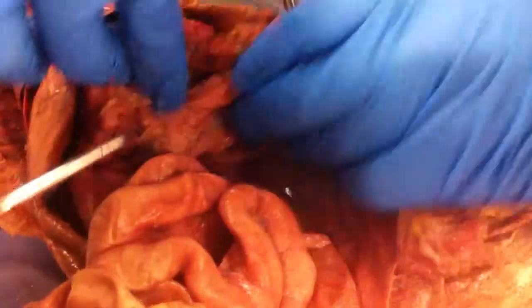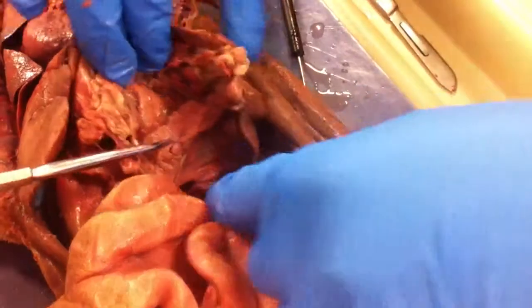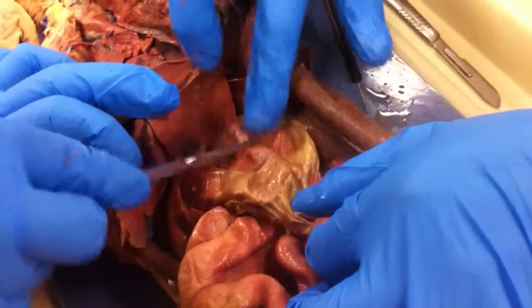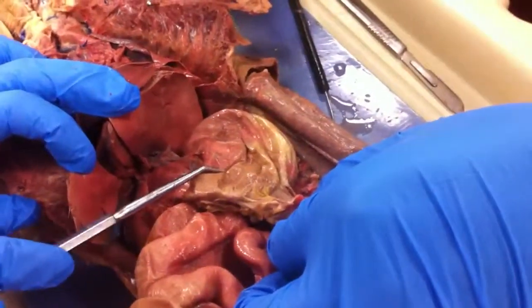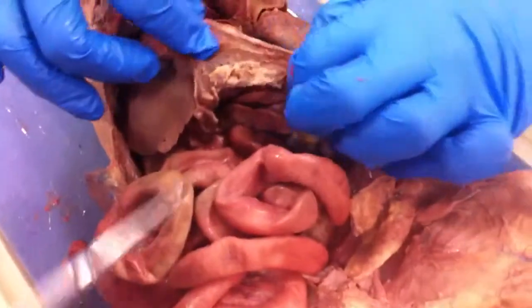And then if you move under the stomach, you have the pancreas right here. Then on the side of the pancreas, you have the spleen. Alright, this is the stomach, which stores food and breaks it down. It's located directly below the liver. This is the greater omentum. It's a sac covering. It holds the organs in place.